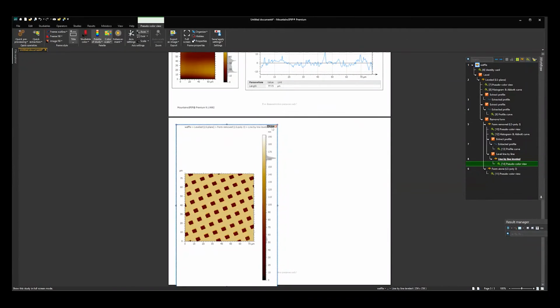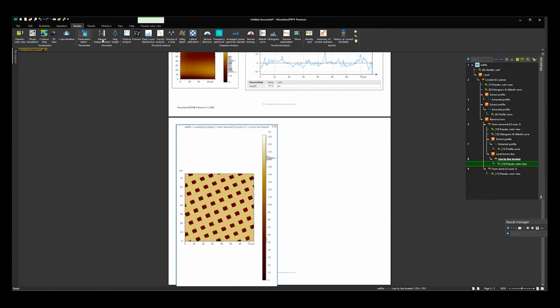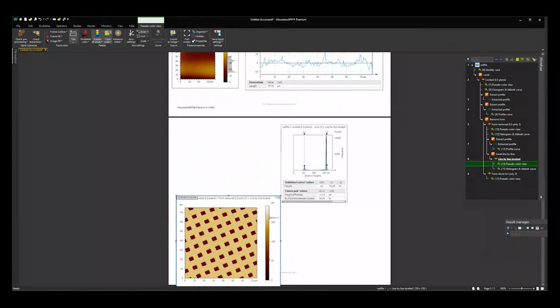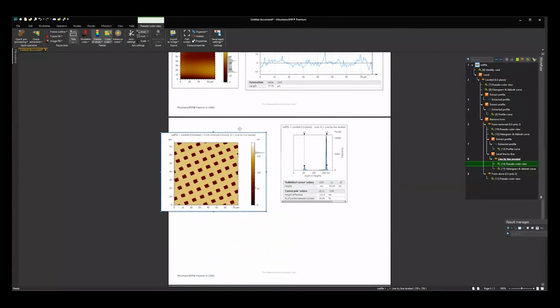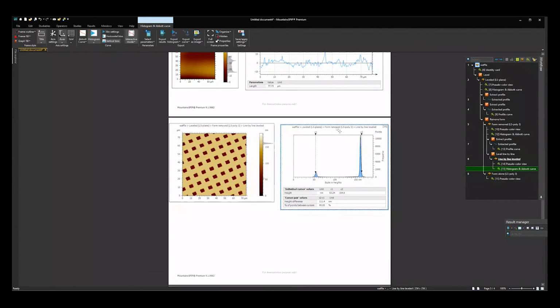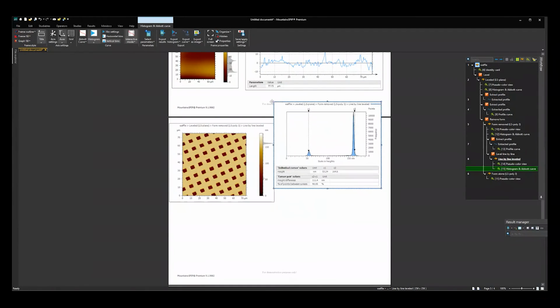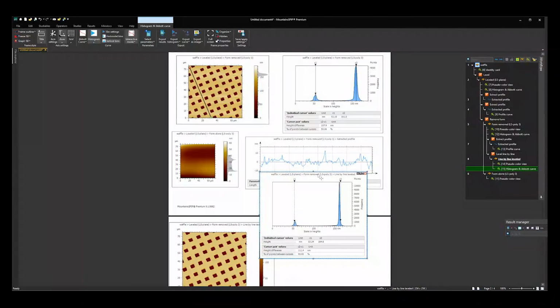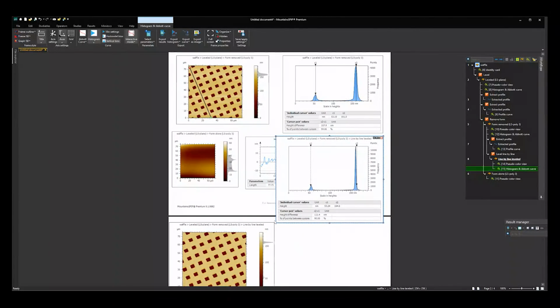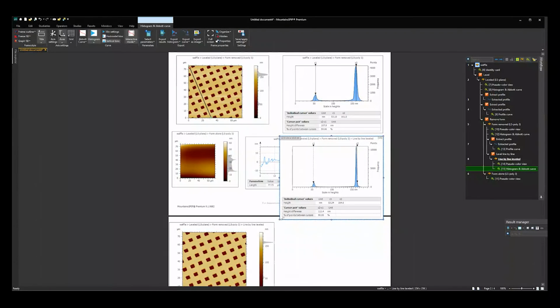The best way to analyze it is our histogram. So I'm going to reduce this back. All right, so how does this histogram now compare? Let's pull it up and compare it with the histogram we just did on the plane fit data. Let's size it correctly.